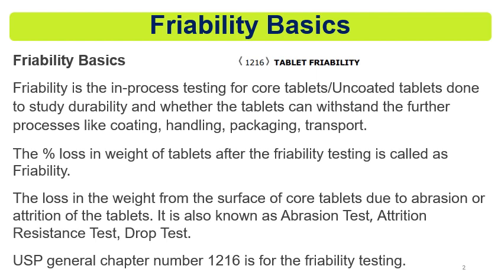If the tablets are friable and these tablets go to the packaging, especially the bottle packaging, and if that bottle is transported, then sometimes the tablet may break during transport and also during handling of the tablets in manufacturing and also by the patient.